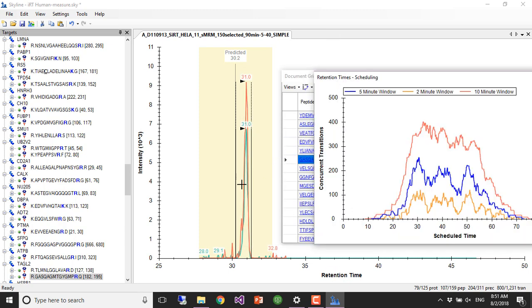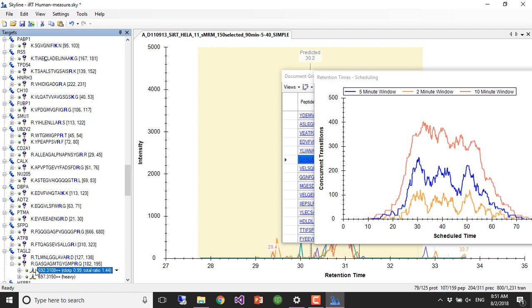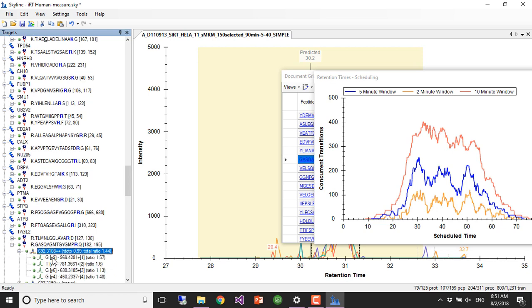And I can check on, so that looks fairly sharp to me. And the points across the peak, oh, let's still look fine. I'm getting 24. Whoops, that's hard to see, isn't it?